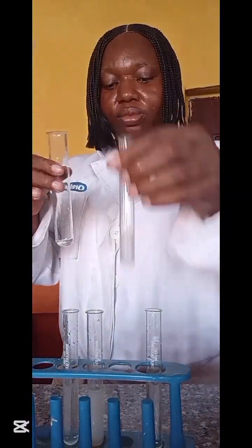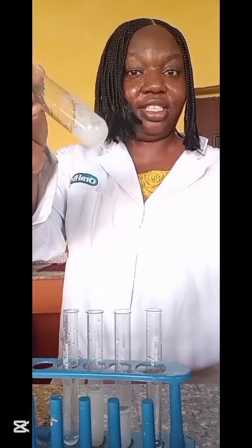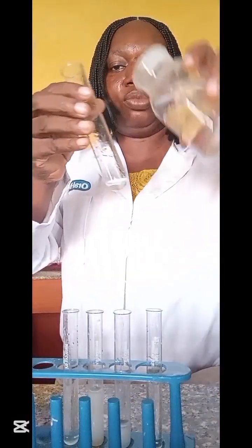Let's check the second one. So this is aluminum solution. Sodium hydroxide in drops, gelatinous. In excess, soluble. You see? So this is aluminum.